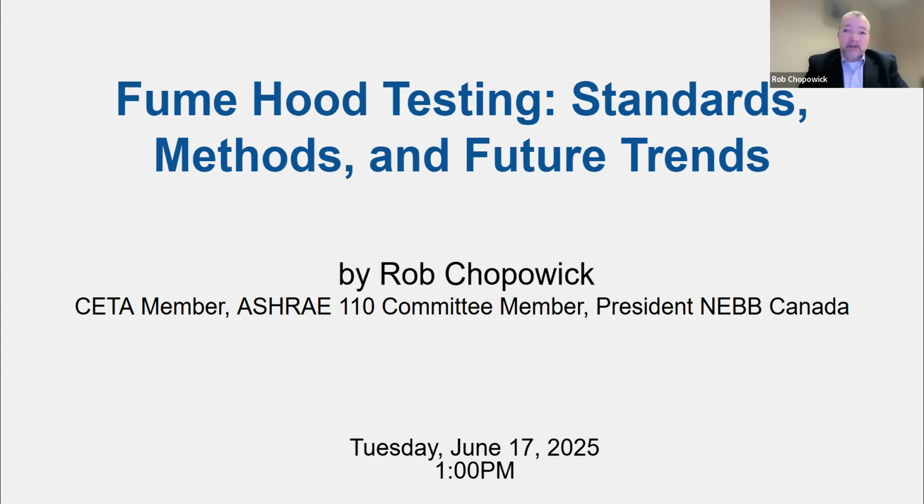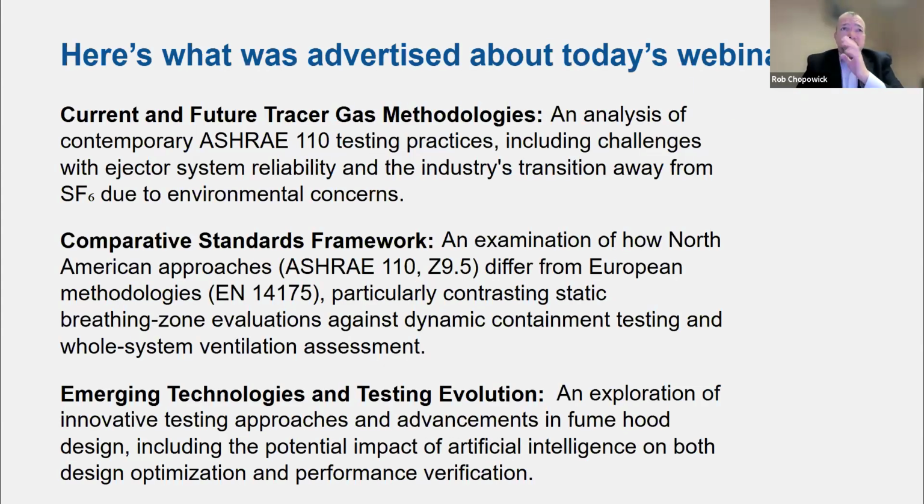Now, today I'm going to share some insights on the current landscape and the future directions in this field of fume hood testing. I'm going to talk about where we are today, how the standards compare, and what's on the horizon.